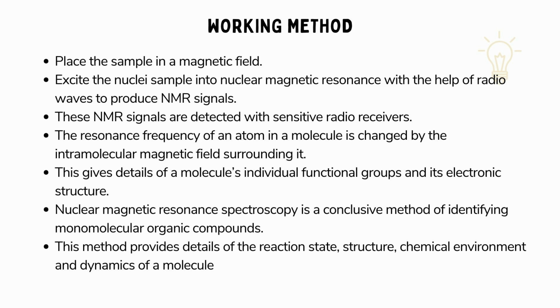The intramolecular magnetic field surrounding an atom in a molecule alters its resonance frequency. This alteration provides valuable insights into the molecule's functional groups and electronic structure. NMR spectroscopy serves as a conclusive method for identifying monomolecular organic compounds. Additionally, this technique offers information on the reaction state, structure, chemical environment, and dynamic behaviors of the molecule.